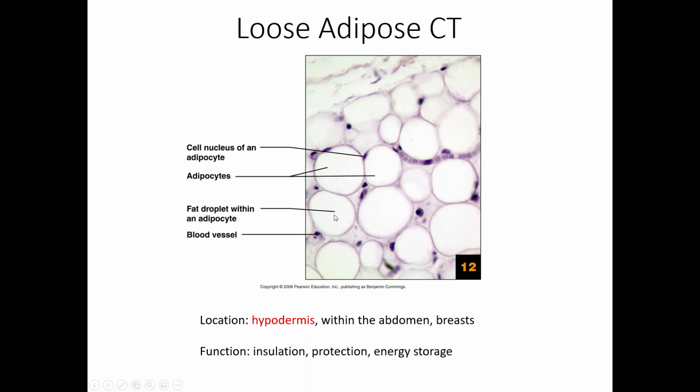Now, here's one thing I want to point out. I want you to be very clear. This is one complete cell. This is one complete cell. This is not empty space.